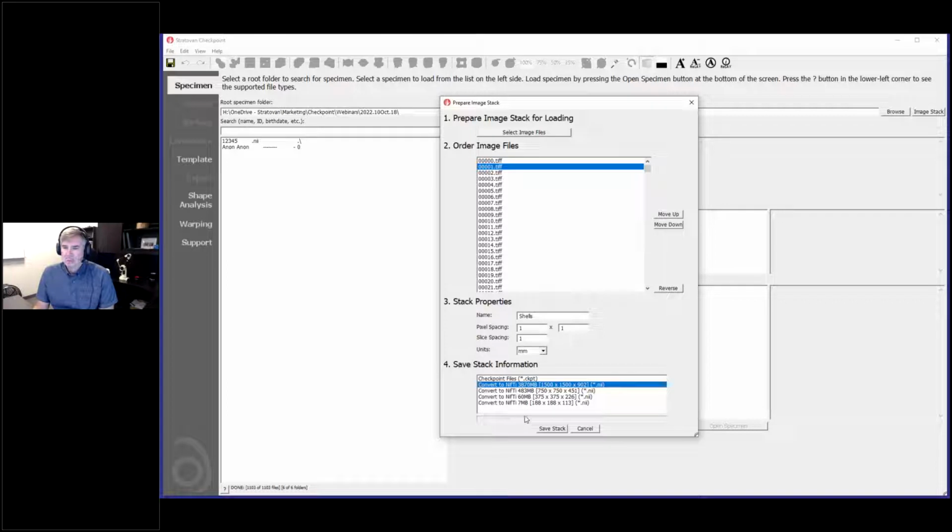And then there are several different outputs that you can do here. One is you can output just a checkpoint file. The checkpoint file is a text file that lives near the data files. Sorry, I think we did. Okay, it looks like it's.